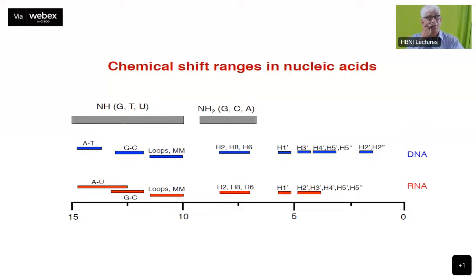Therefore, here we talk about mostly proton NMR. Occasionally we talk about nitrogen 15 NMR or C13 NMR, but that will require labeling of the DNA at nitrogen positions or C13 positions. But most of the developments which have happened have been done using proton NMR quite successfully. So therefore, we are now ready to look at the DNA structure in terms of the proton NMR spectra. Not only 1Ds, 2Ds, 3Ds, everything can be done with this kind of thing.